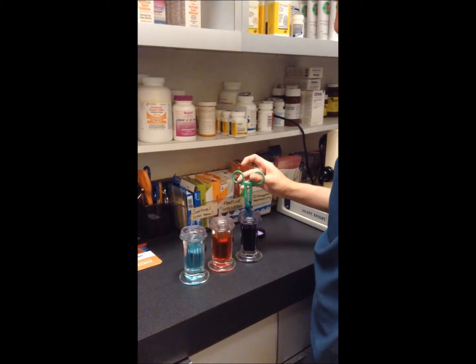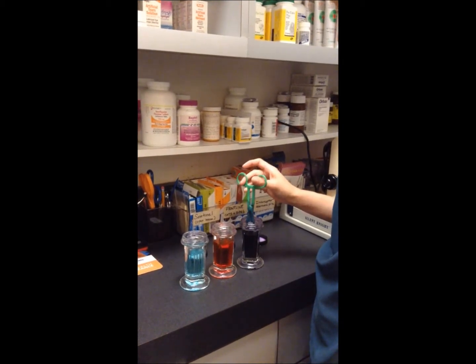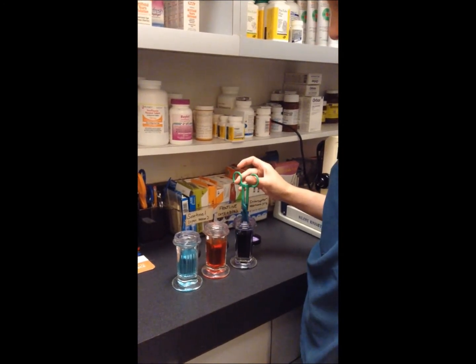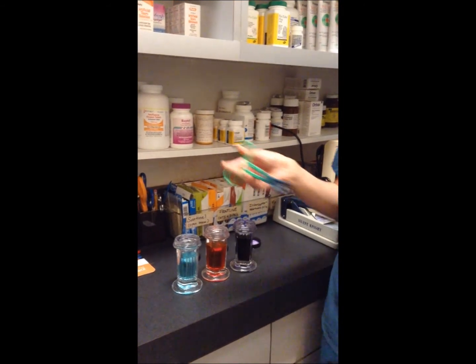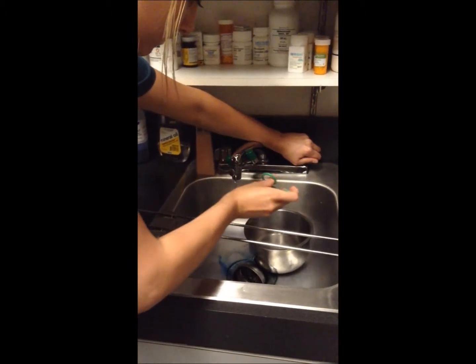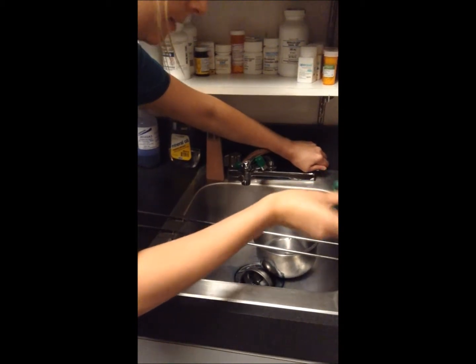And then after you're done staining, you rinse the slide off slightly and then you would allow it to air dry. And then we'll discuss how to look at it under the microscope. So, just gonna lightly rinse it off. And then we'll allow it to dry.